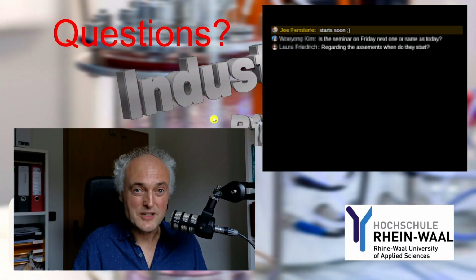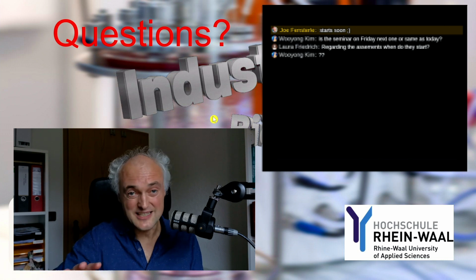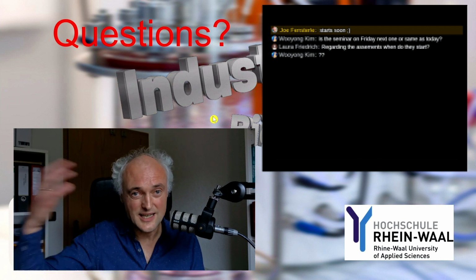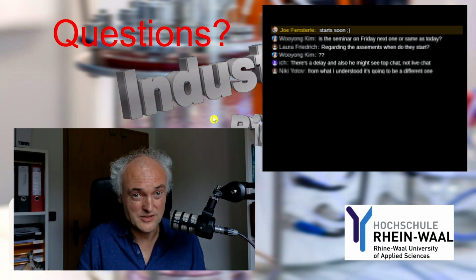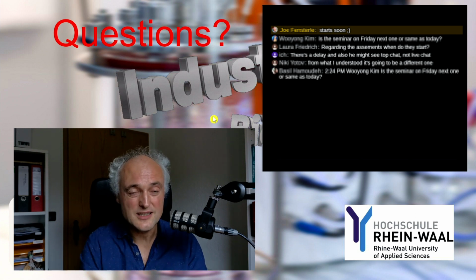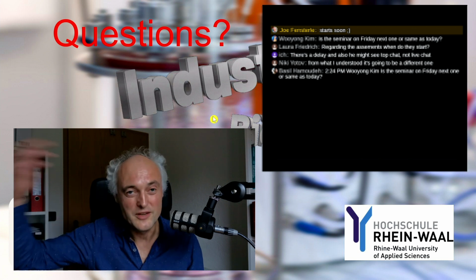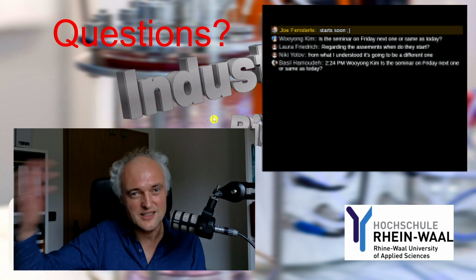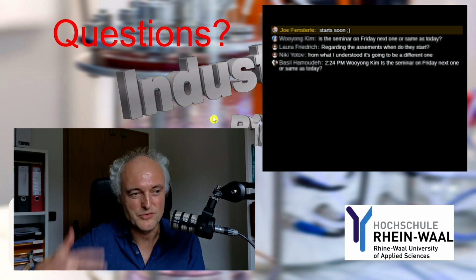So first, to the seminar. These seminars are all successive. It's not a repeated seminar and so on. So now we start, we go on next Friday, we go on next Wednesday, and so on. You should follow all the seminars. It's not that it's repeating something. So it's all different. Follow them. I just want to concentrate on learning how to use the software at the very beginning so that we don't lose too much time. Of course, also for me, it would be more comfortable to do that each week. However, then you would start to know how to use the software at Christmas, and then there is no time left for doing the things.